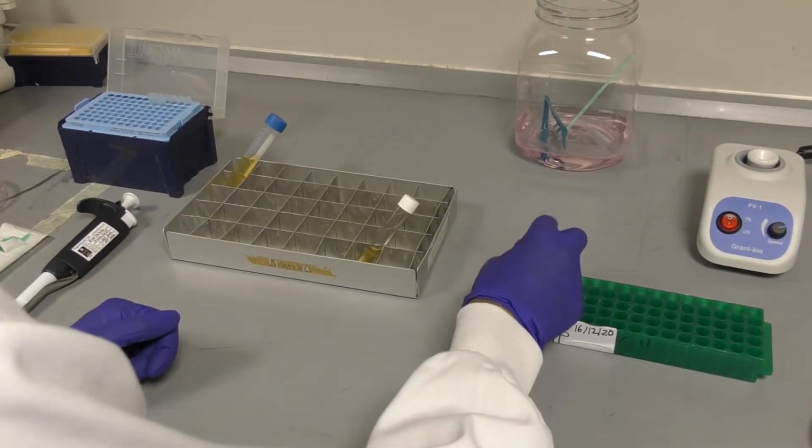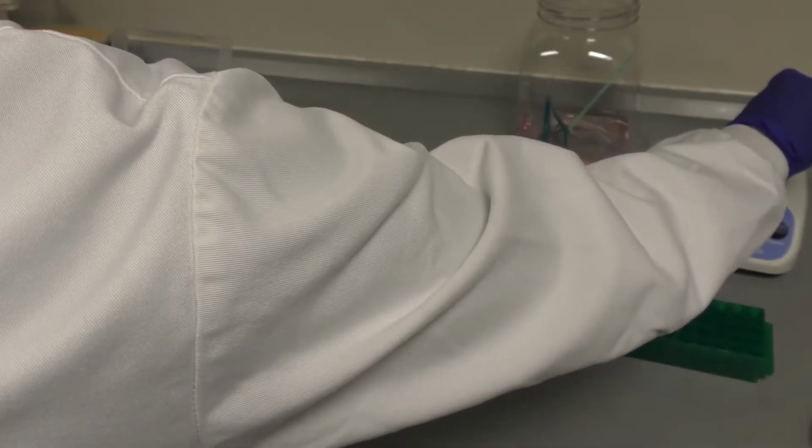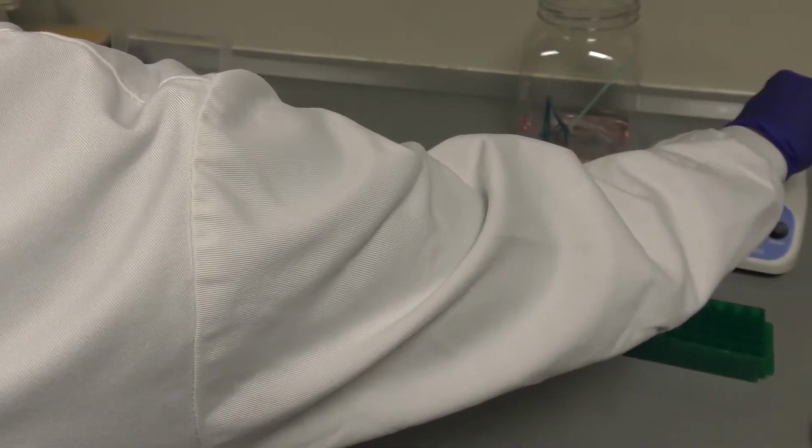Vortex your vial 5 STGG vial for at least 15 seconds. Repeat this for all the specimens you're going to process.